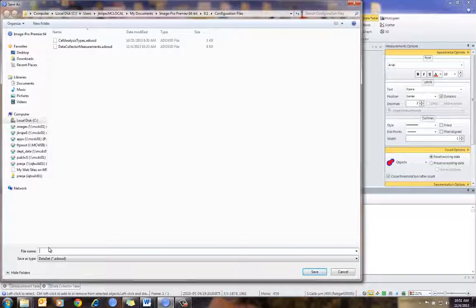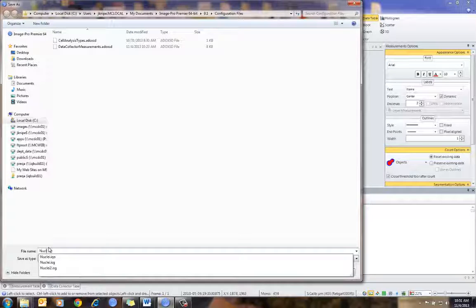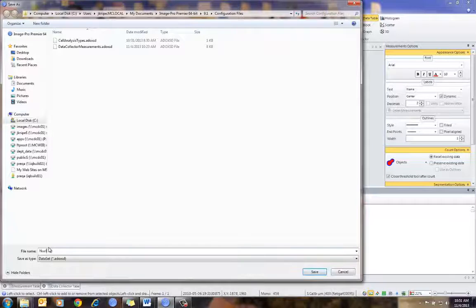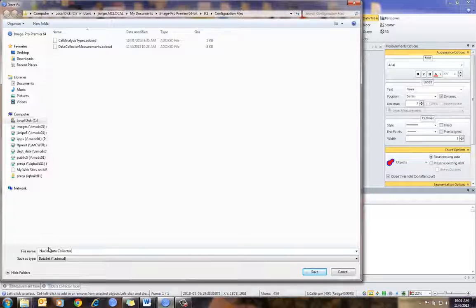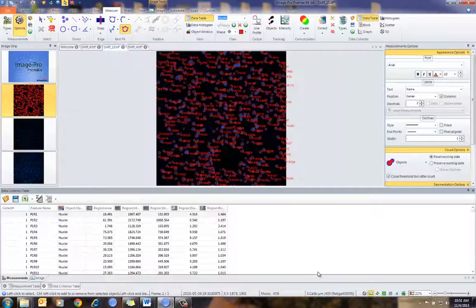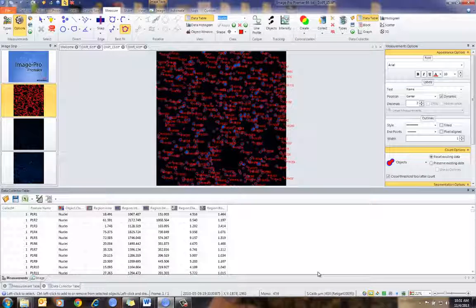In this case, I'm just going to give it a name — call it Nuclei Data Collector — and then save that. You'll see that it puts its own extension underneath it. So now I've set up Data Collector and I'm ready to go.